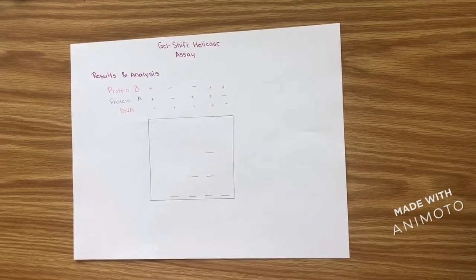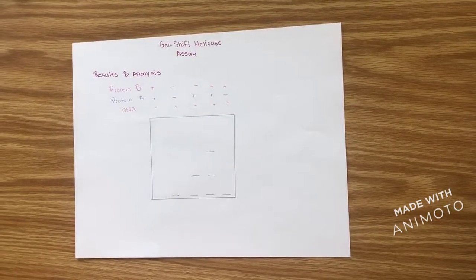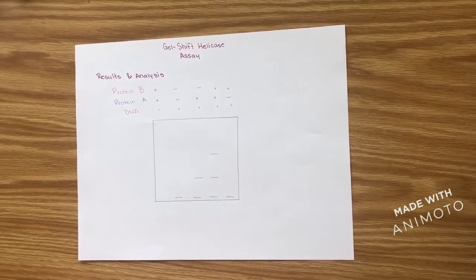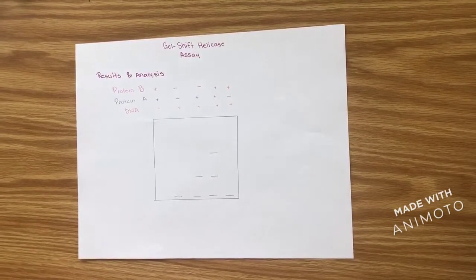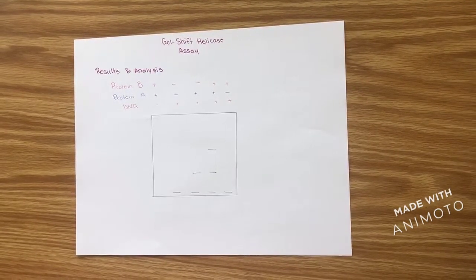The first thing that is seen is that there are no bands in the first well. That is because there is no DNA for the protein to bind to. The second well has just the DNA band and, as usual, is the lightest molecule. The third well has 2 bands, one for DNA and one for protein A.